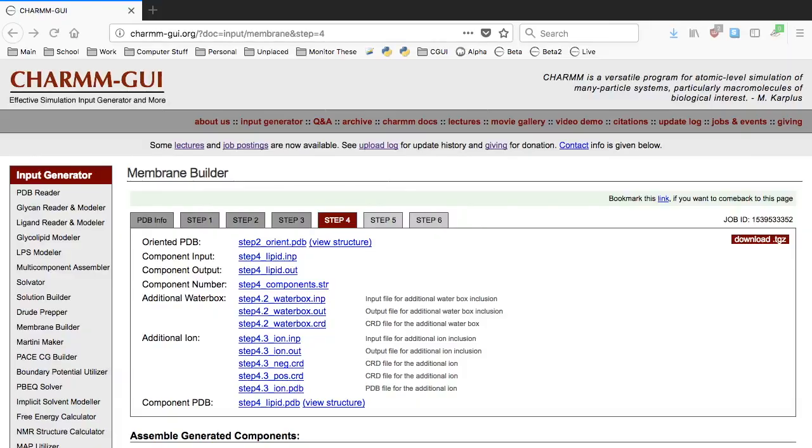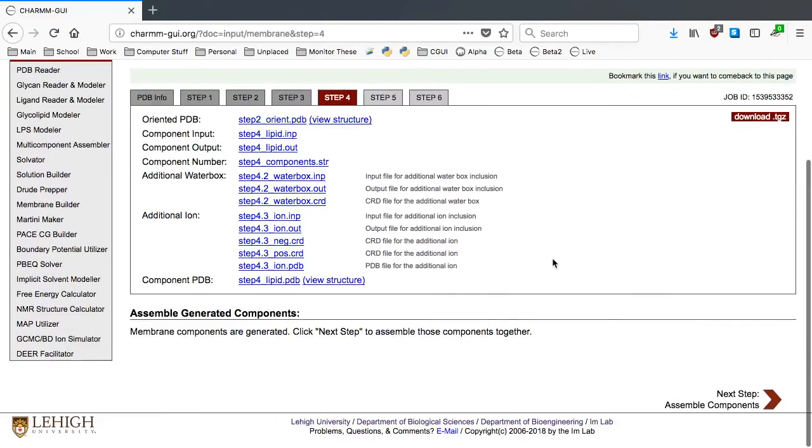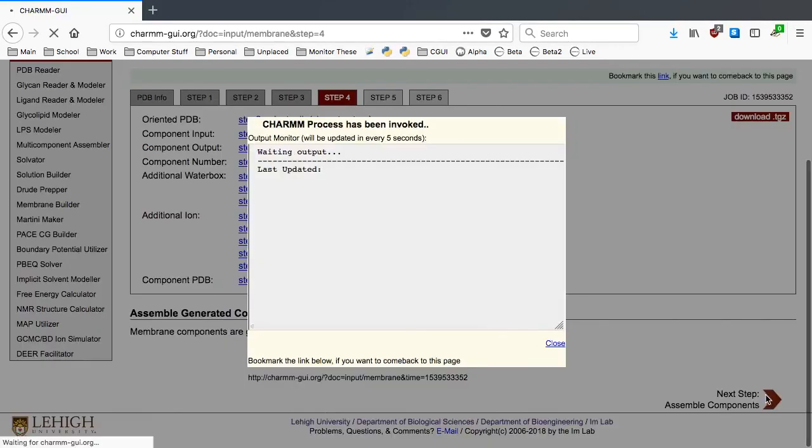Now we have all of the components for our CTB-GM1 complex model, using a DMPC bilayer, waterbox, and ions. So click Next Step to assemble them. It should take another 3-4 minutes.